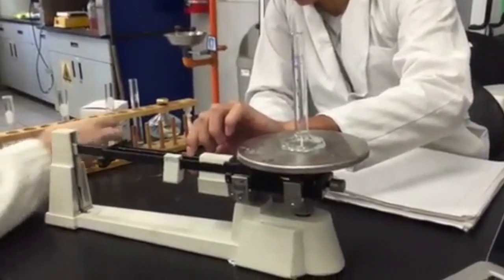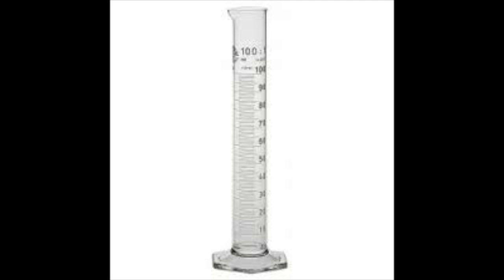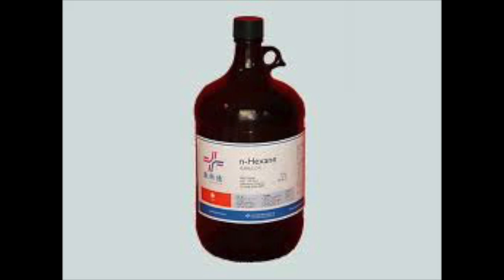In the next clip you will see the lab equipment that we used, which includes a scale, 4 test tubes, a test tube rack, and a graduated cylinder. We also used a burner. For the experiment, we used 4 different substances. We used turpentine, cyclohexane, hexane, and an unknown substance. We tested their density, solubility, flammability, and whether or not they were saturated.